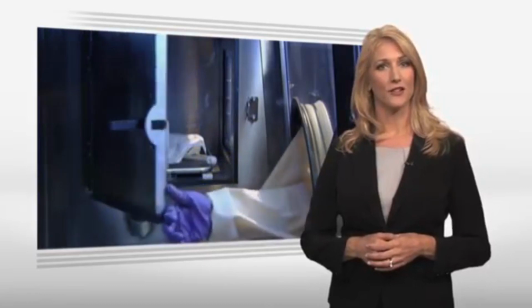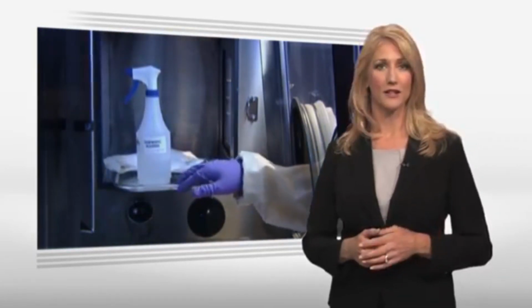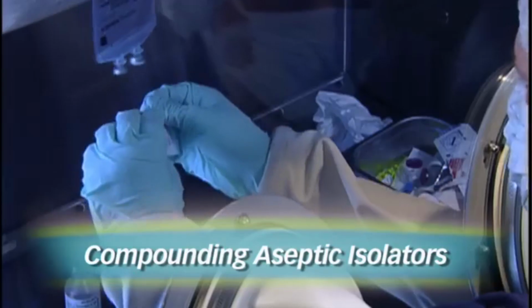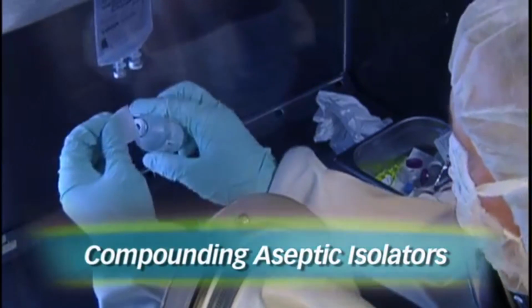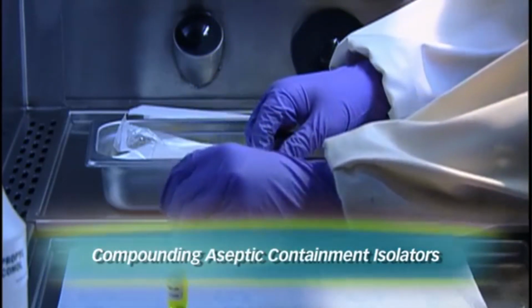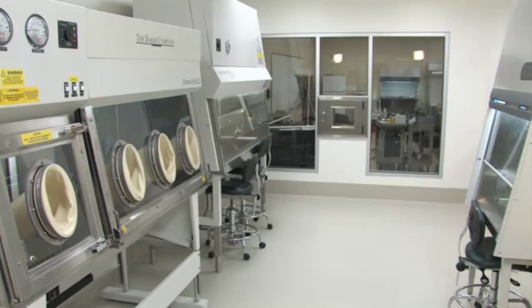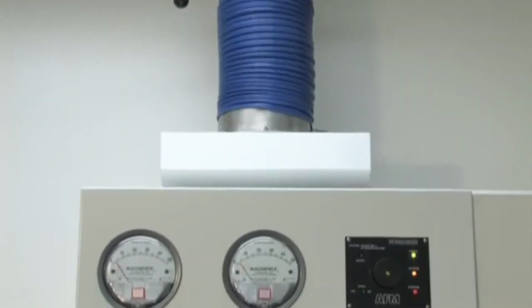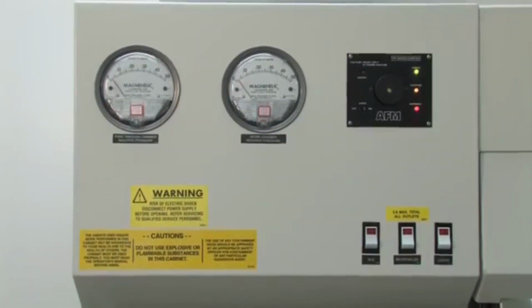The barrier isolator system uses a technology to minimize personnel contact and separate the external environment from the critical site. Compounding aseptic isolators are used for the preparation of non-hazardous CSPs, while compounding aseptic containment isolators are used for hazardous drugs such as chemotherapy. An isolator can be a useful alternative to a traditional laminar airflow workbench in a clean room, but the isolator must be supported with proper operation, maintenance, monitoring, and control procedures.